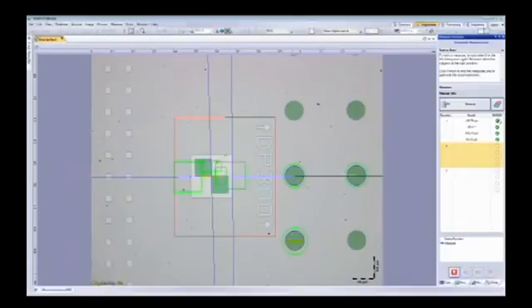So another thing real quick, we can see okay and not okay. So we programmed in tolerances. You can program into your inspection at the same time. With these tolerances, it's a quick visual inspection that it's passed. If it didn't pass, maybe they need to take the sample off and do more processing to it.